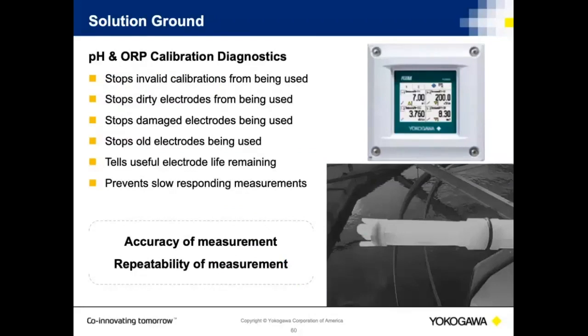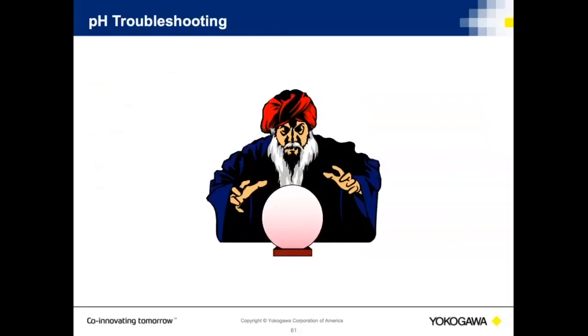Barring that, if you just put a pH probe into solution and let it run, it could be giving you good indications, or it could be starting to become coated over. If it does start to become coated over, we can use the diagnostics to understand if the probe is going out of its tolerance values.